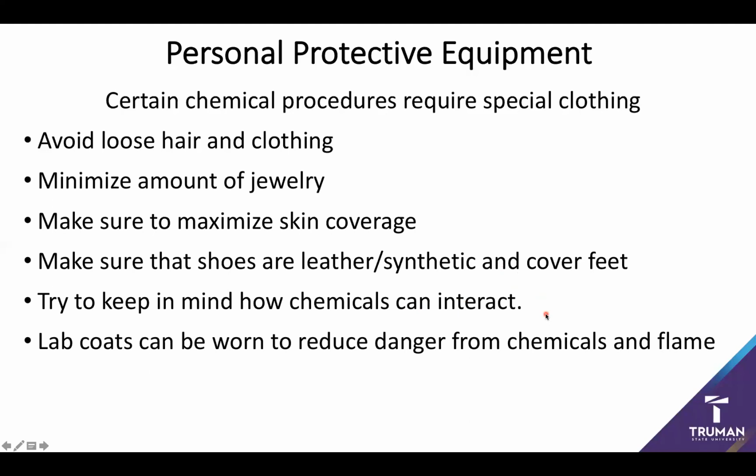One of the other things you can do to help prevent any sort of danger is to make use of a lab coat. Lab coats are highly encouraged when working in most chemical labs because they offer protection for both chemicals and flame.